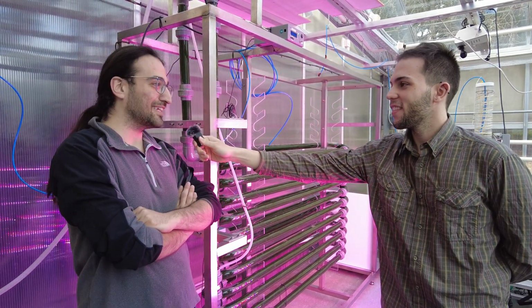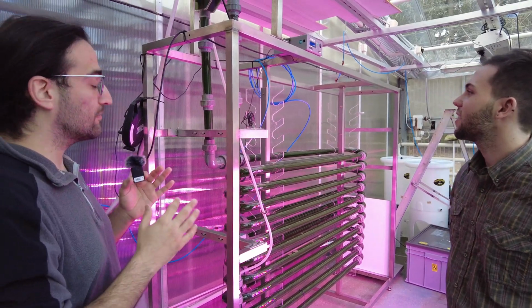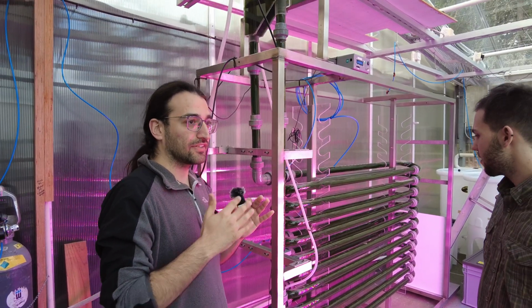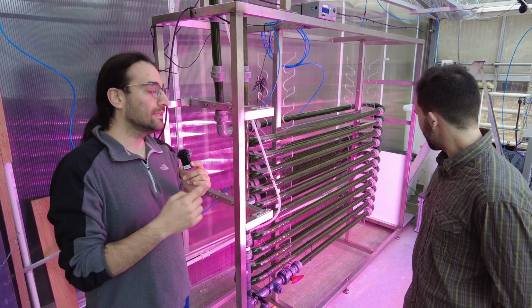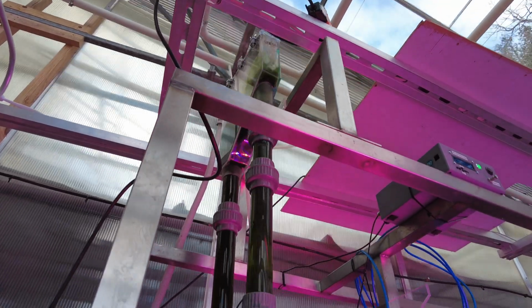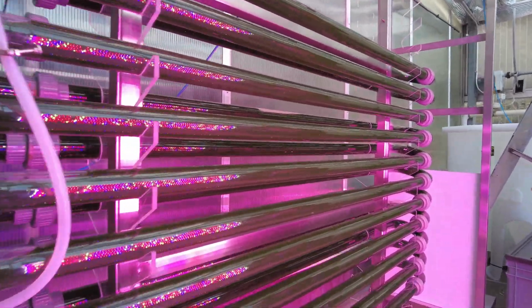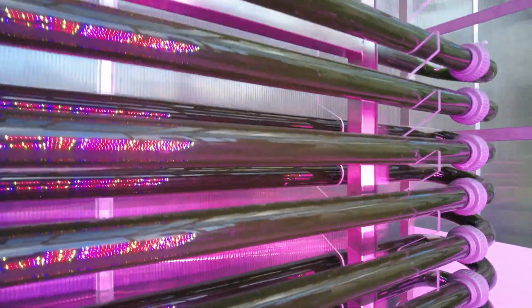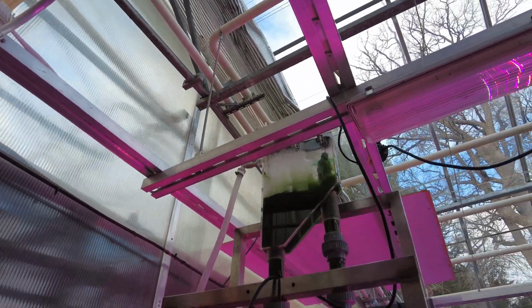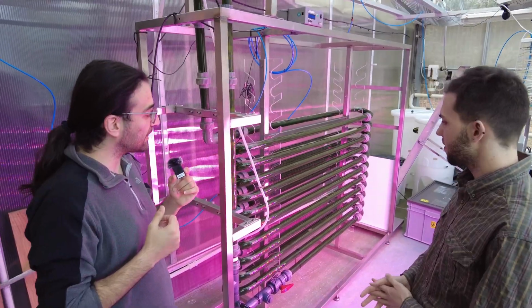Yes, this fancy sci-fi setting is called the photobioreactor. And in the photobioreactor, we are trying to create a system so our algae can always access the nutrients and light and the other gas, which is carbon dioxide and air. So in the PBR, we are making sure that our algae is always running endlessly in those glass tubes and using the nutrients that are coming from the wastewater. So we are treating the wastewater as our algae grows in this photobioreactor, and we can harvest the algae and separate the treated water and algae in our filtration systems that I can show you later. So this machine enables us to grow algae at a very robust rate, let's say.